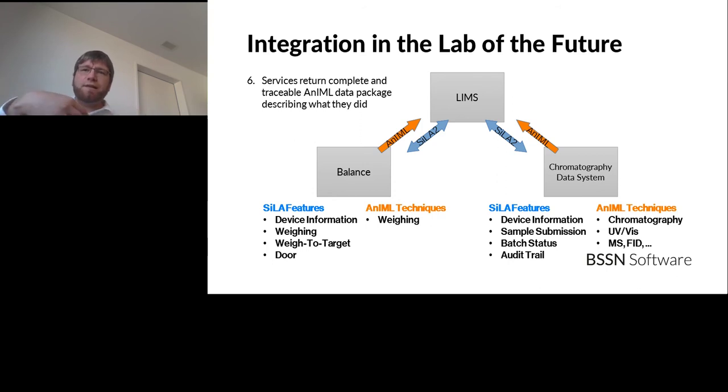So this is a way of executing these types of interactions very, very efficiently. And since nowhere in this concept a file ever hits the disk where it could get lost and where a folder has to be monitored, I have a very high degree of data integrity. And from a compliance perspective, this is also much preferable.